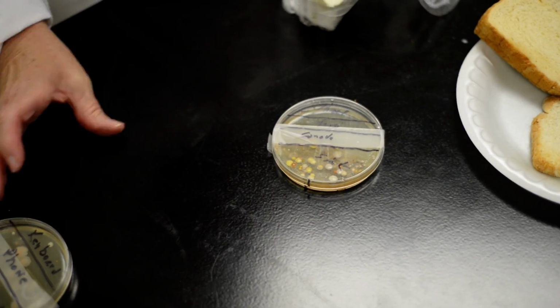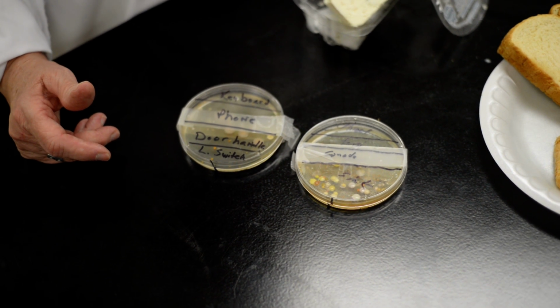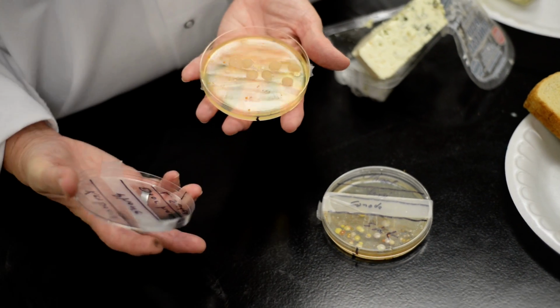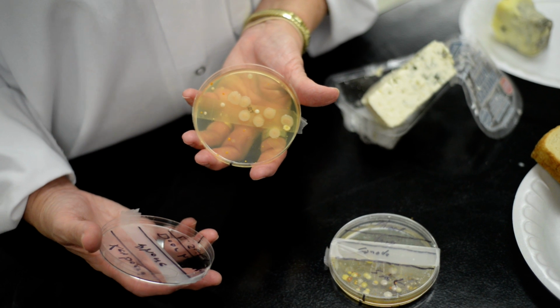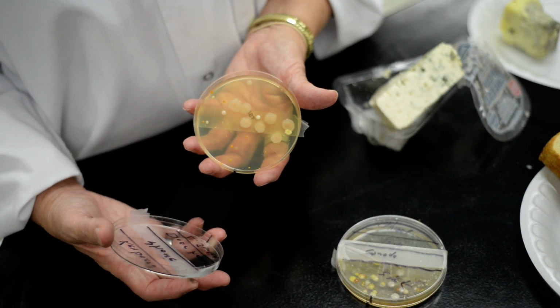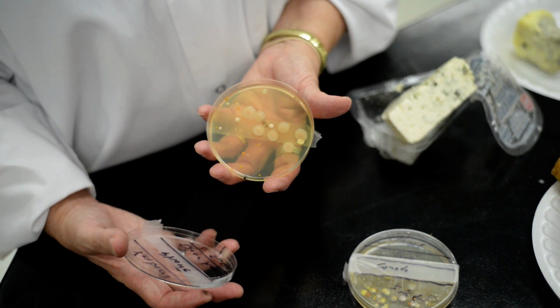Also, it'd be good for your students to know about using agar and making biological samples, or making samples for your chemistry lab of what kinds of things are there. Kids enjoy seeing what will grow in terms of a culture. I did buy the agar already poured. To me, that's easier than pouring your own agar, but you can do that as well. I have read that you can use clear gelatin. I've never tried that. You might give it a whirl. Obviously, that would be a cheap way to go. But I bought 4 of these containers with already poured agar for like $6. So it's not a big investment.